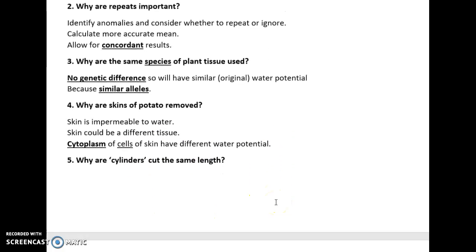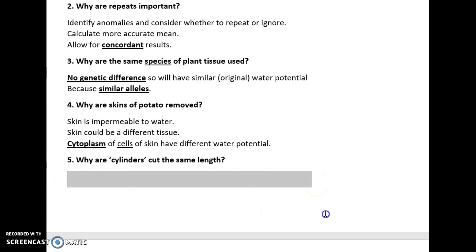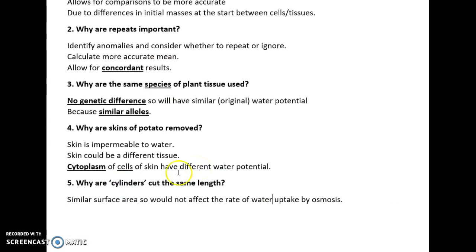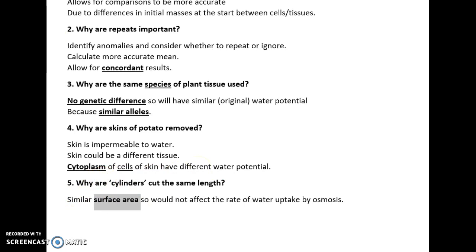Why are cylinders cut to the same length? To account for differences in surface area — by keeping them the same length, they have a similar surface area, which means it will not affect the rate of water uptake or loss by osmosis.